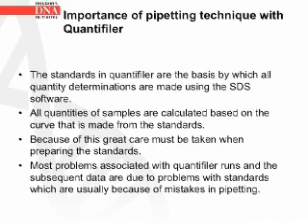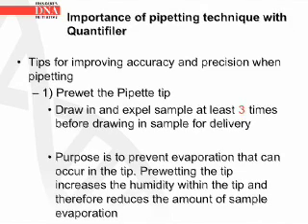The standards in Quantifiler are the basis by which all quantity determinations are made using the SDS software. All quantities of samples are calculated based on the curve that is made from the standards. Because of this, great care must be taken when preparing the standards. Most of the problems associated with Quantifiler runs and the subsequent data are due to problems with the standards, which are usually because of pipetting mistakes. Now we will go over some tips for improving accuracy and precision when pipetting.